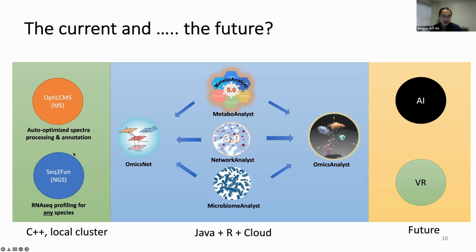And on the left side are the things related to raw data processing, and we are actively developing that. If we cannot get raw data consistently ordered to meet a certain quality, all the remaining steps will be hard. So this is something we started doing. Also, we are going back to developing some raw data processing in C++.